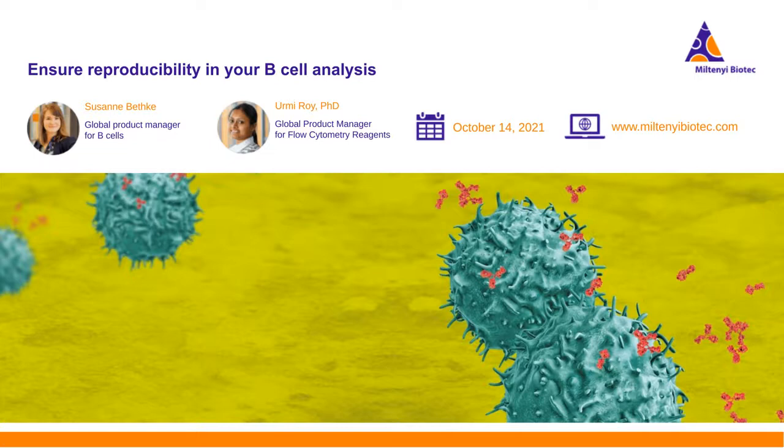And if you want to go with the magnetic beads, as I said, you can also couple your protein to a magnetic bead and then isolate it this way. This way you can nicely enrich the B cells, with purities still going up to 60%, which is still a very nice approach for these cells.